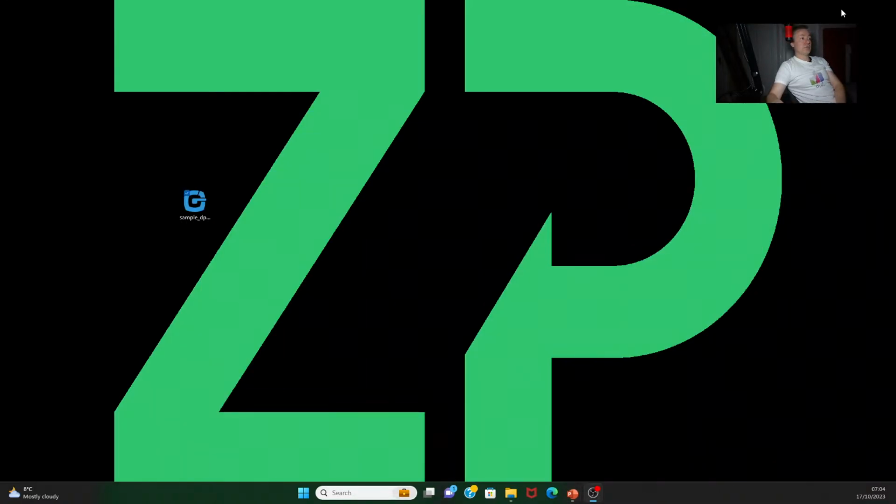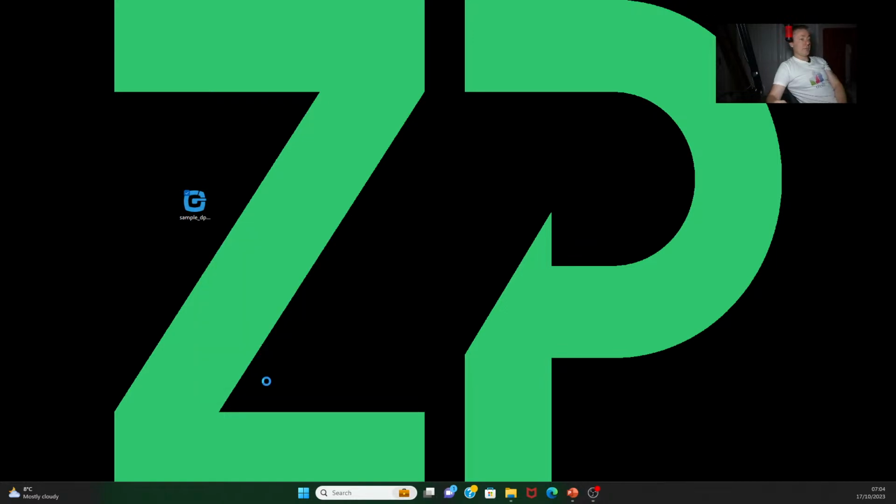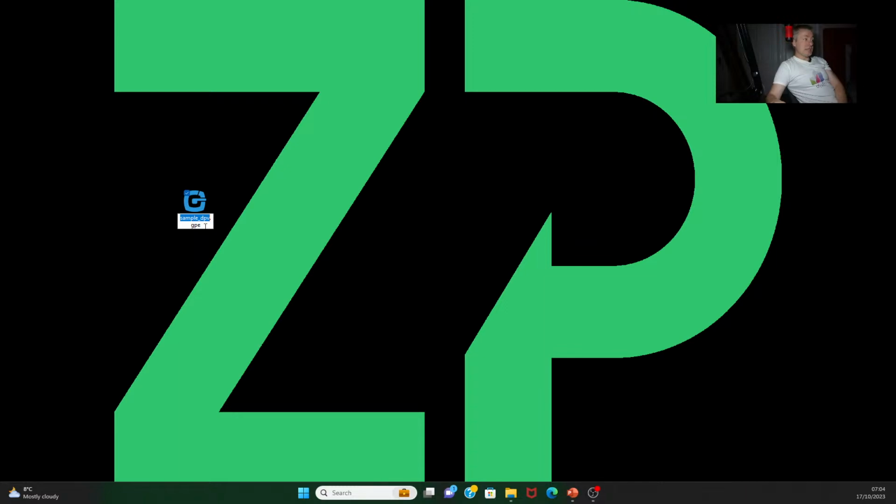So I say here a quick demo. Let me do the demo now. So this is the file from Galvanoplot. The Galvanoplot potentiostat has essentially gathered that data. The first thing I'm going to do is rename it. I'm going to take off what's called the GPE suffix here and just make it into a text file.